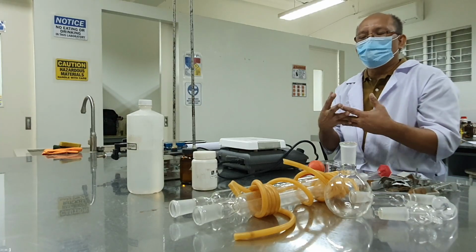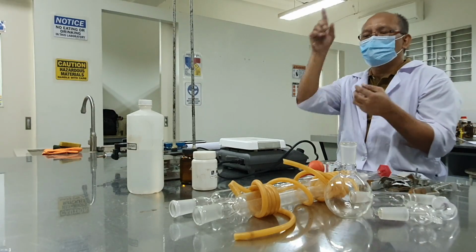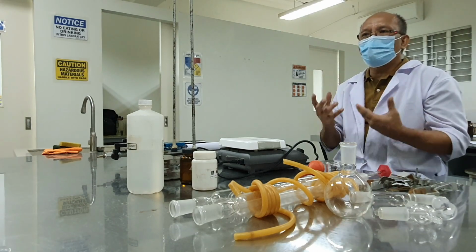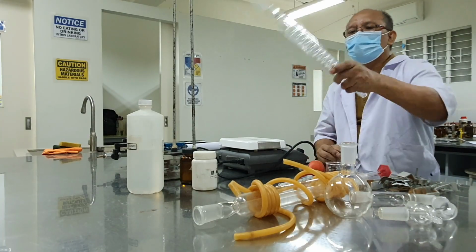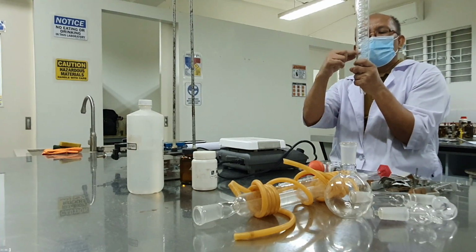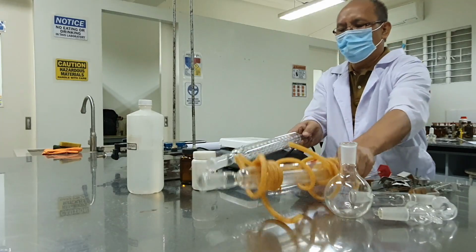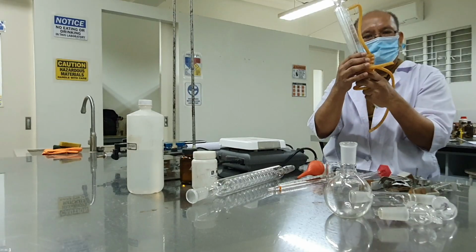So instead of doing that, scientists developed a glassware in which you can do multiple simple distillations in one setup by just introducing a fractionating column type of condenser. You will notice a fractionating column because there is a coil like this, and every coil here, class, represents one simple distillation process. In a simple distillation, you only have this one here. You call this the condenser.